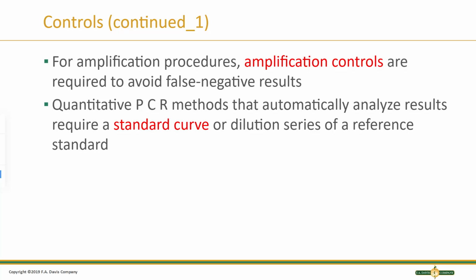Amplification is talking about when we do polymerase chain reaction, where we make many copies of a particular region of DNA to be able to visually see that region of DNA. If we try to make the copies from a big segment of DNA and we run it out on a gel, which would separate those copies from the rest of the DNA, and we see a band of those separated copies, then we know that the gene was present.